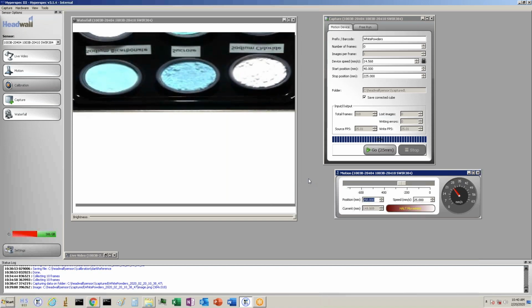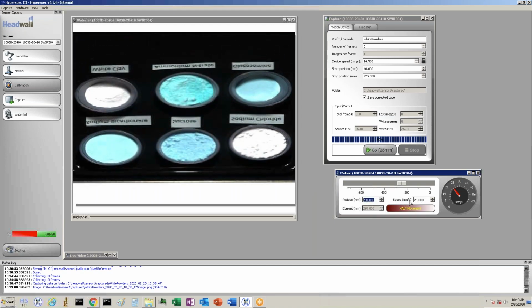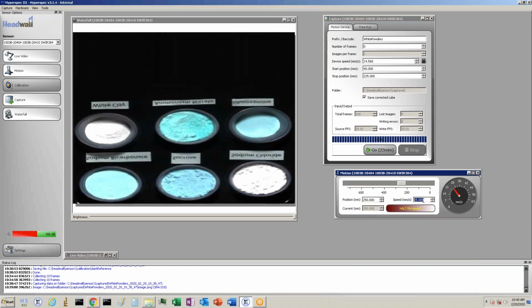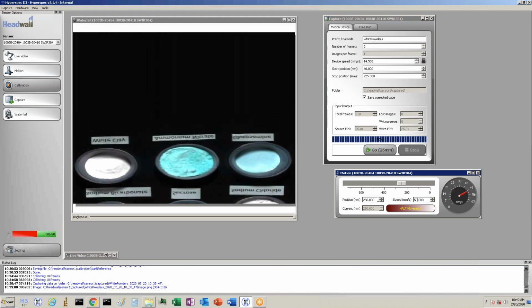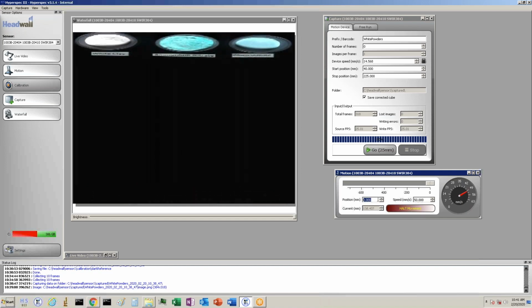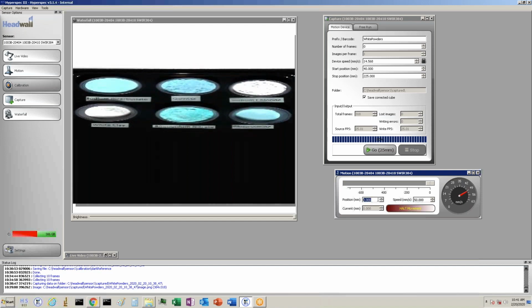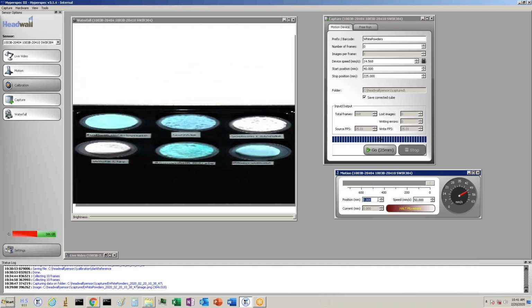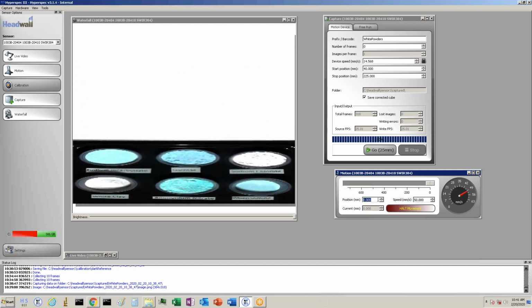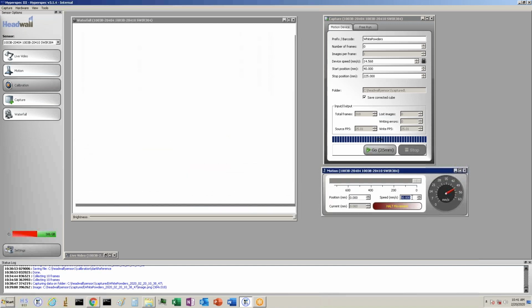Here you can see that the white powders are scrunched in this image when the stage is scanned too fast. And let's see if I can scan even faster. So you can really see the image is scrunched now, and you actually get less resolution in the travel direction because you're scanning too fast. And now if you scan too slow, you will be elongated in the travel direction.